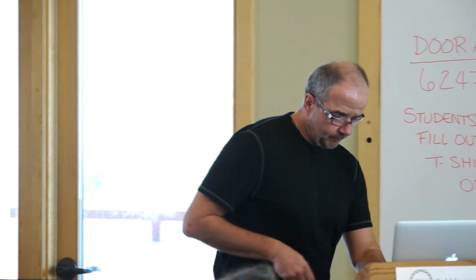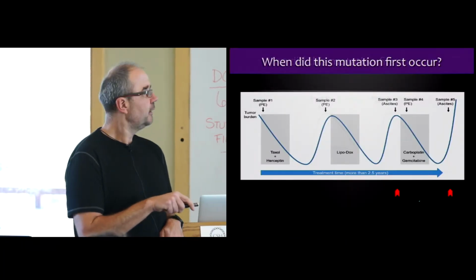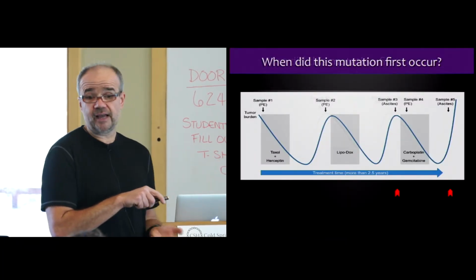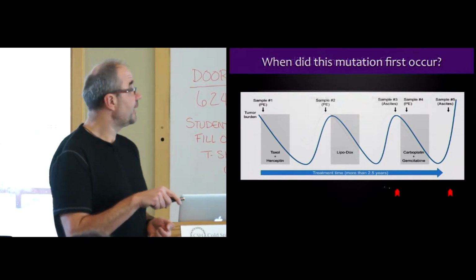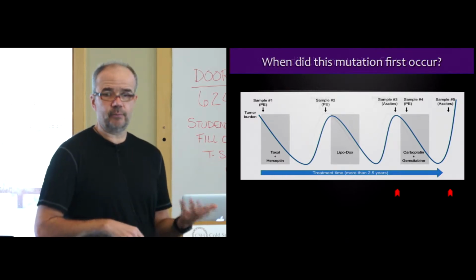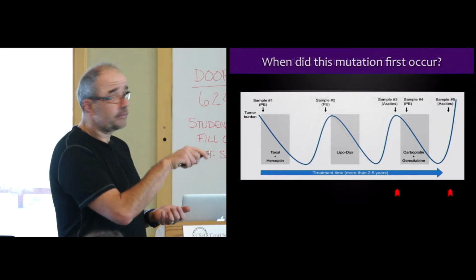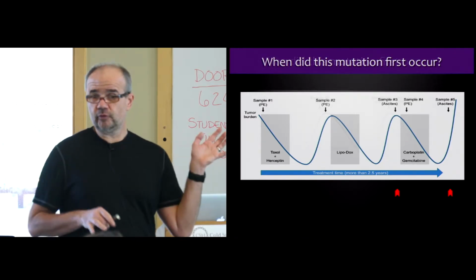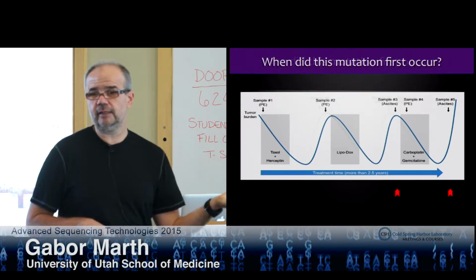So, all right, but going back, here the idea is that suppose we find a variant at this particular time point at fairly high frequency, 30% or something like that, and we didn't see it before. Biologically, it's very important to know whether it really came since the previous sampling and was not present at all, or was it present but at very low frequency and now it got selected for.